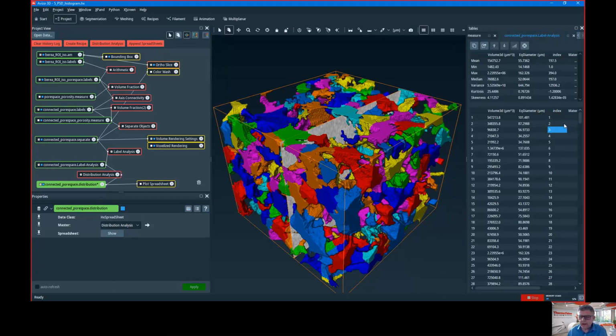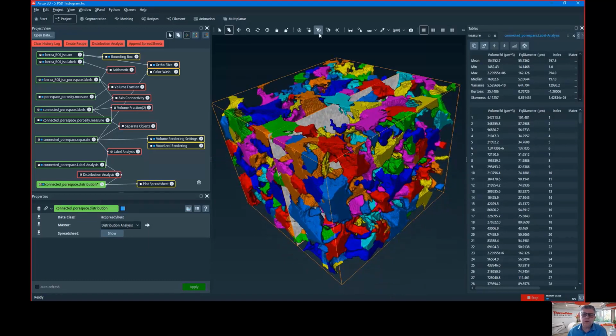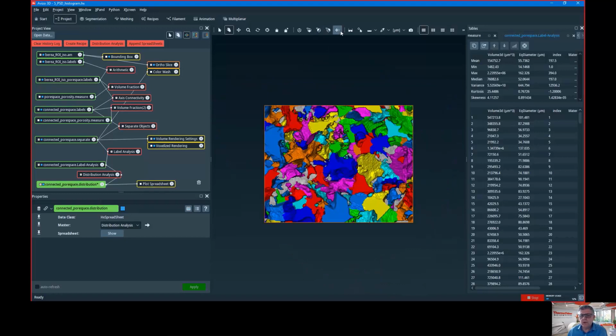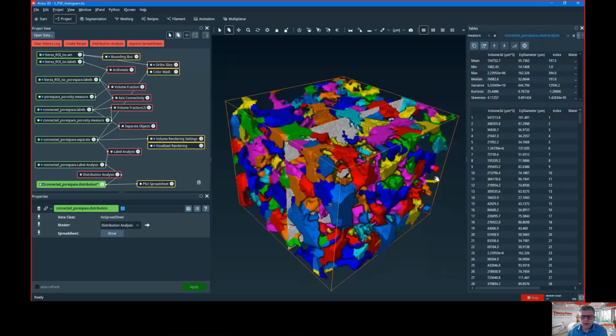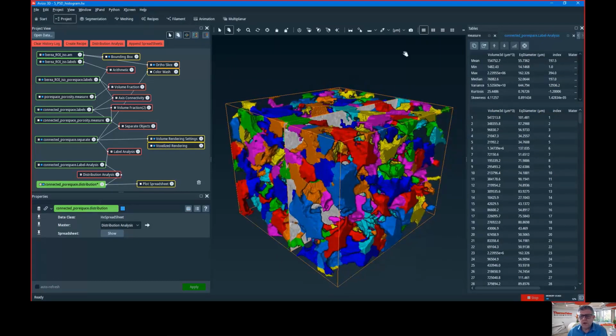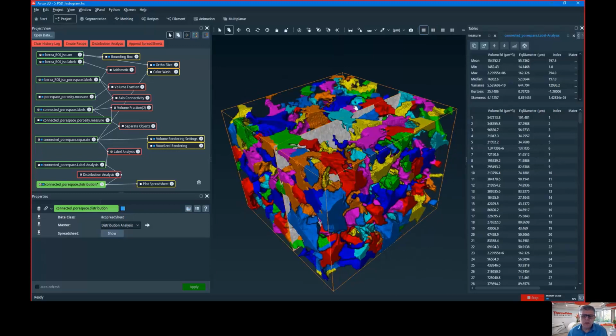So you have plenty of different areas. The main viewer, there is usually one 3D viewer. It could actually be put in 2D mode if you want. If you just select a different point of view here and you remove the effect of perspective, it will look almost like a 2D viewer. Indeed, it's not. The viewer is always a 3D viewer. In reality, we don't have a specific 2D viewer. You could have multiple viewers if you like, but many people stay with one. We can have up to 4.